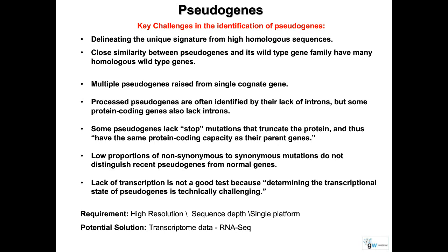So the main requirement for better analysis is we need to have really high resolution, in-depth sequencing, minimum 100x or more than that.